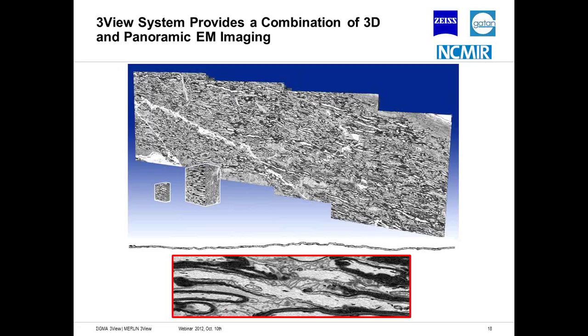And they were able to collect enough data to generate statistical analysis of the data set, and they realized that they're kind of randomly distributed. They are randomly distributed. They are not located at the nodes. And so they were able to really solidify that because of the amount of axons, 50, and the amount of mitochondria that they counted in each axon. And that's just something you wouldn't be able to do by serial sectioning.